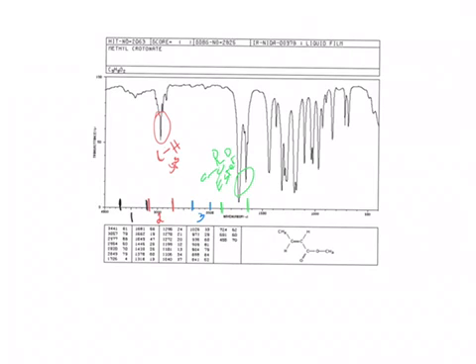The fifth group we're going to see here is going to be from 1680 to about 1450. And here we're going to have double bonds. So I'll highlight this in yellow from about 1680 to about 1450. So right here, it's going to be the fifth group, and I forgot to label this one. This was the fourth zone. And this was zone number 5. And here we're going to have alkene groups, so carbon double bonded to another carbon, or an sp2. And after zone 5, we have this region here, which is known as the fingerprint region, and we don't pay too much attention to this region. We just focus on zones 1 through 5 and see which functional groups are evident in these zones.